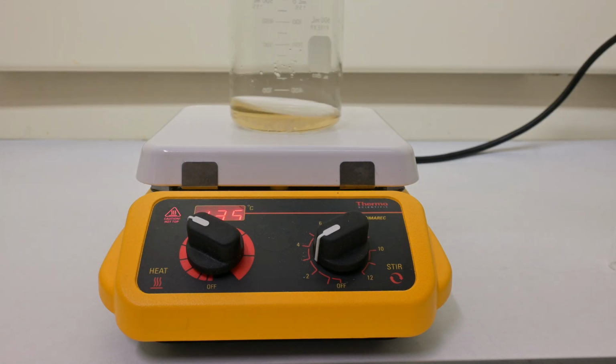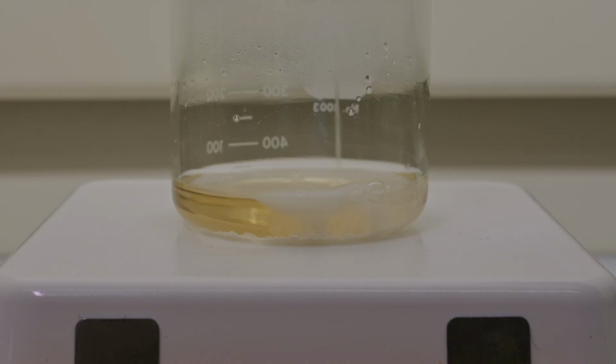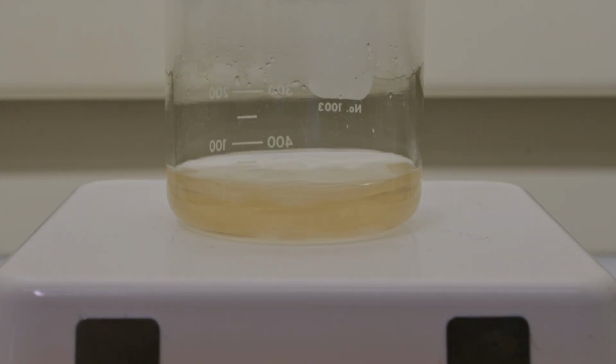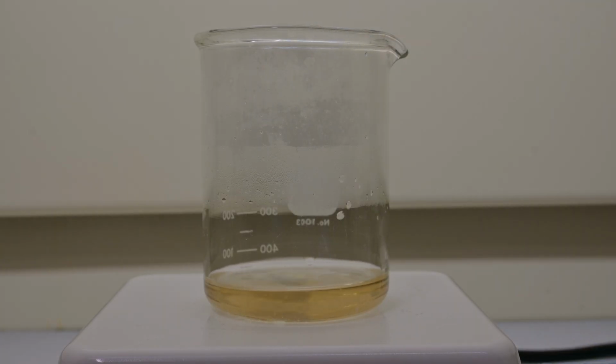It is then warmed slightly on a hot plate to aid in dissolving the sulfanilic acid. The acid did not dissolve completely, so I added a little bit more of the 5% sodium carbonate solution, 5 to 6 milliliters. We need to ensure that it does not exceed 6 milliliters, as adding too much solution will add too much base, which will prevent the next step from occurring. I then threw in a stir bar to help agitate the solution and help it dissolve faster.